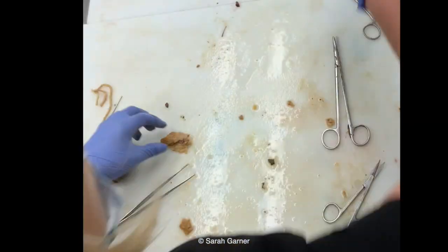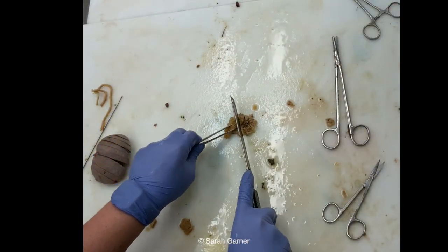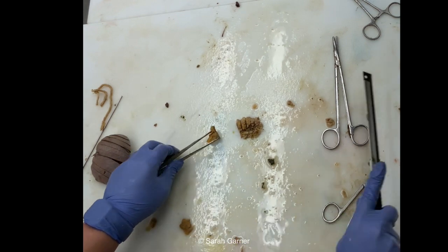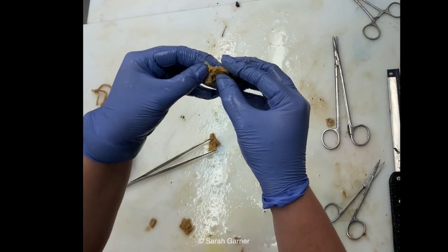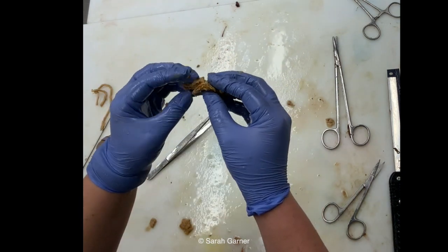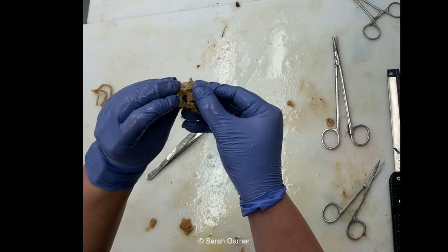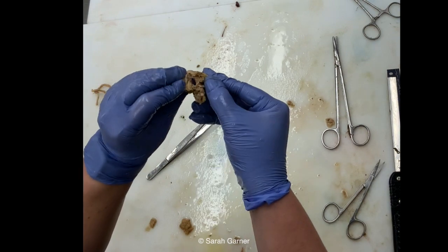That was the right, and then you would do the same thing with your left. This one still has a good bit of fat on it. You should really trim off as much as you can before you weigh them. That's a pretty good cut surface for a fixed adrenal. So that yellow outer part is cortex, and that middle part would be the medulla. Remember, the outer part is yellow because of those steroid hormones, right? And you pretty much see it there.